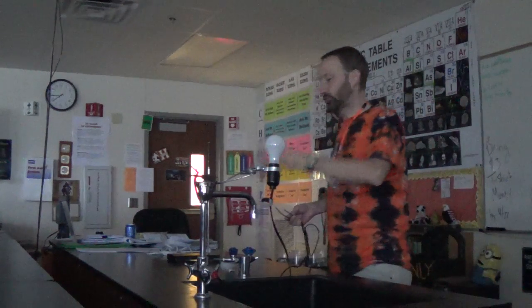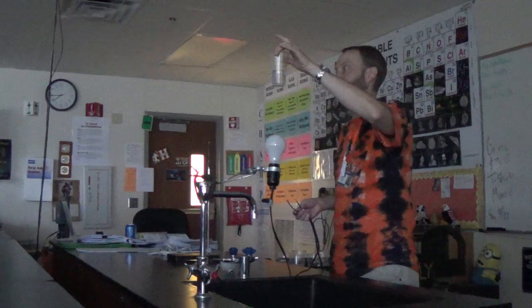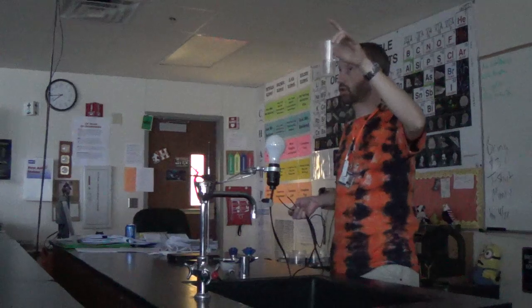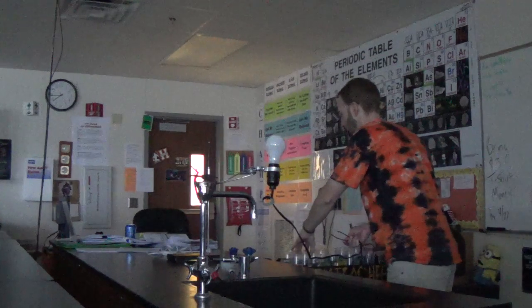Maybe some of the sucrose dissolved. It is very possible because sucrose is a lot more alike to ethanol than salt was. Maybe a little has dissolved, but even if it did dissolve, it's not going to ionize, regardless of what you dissolve it in. So it definitely would be a non-electrolyte from both ideas there.